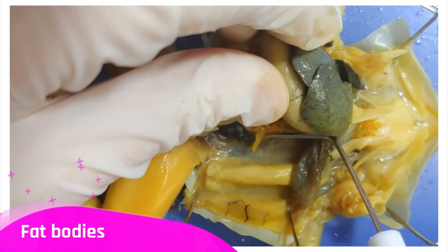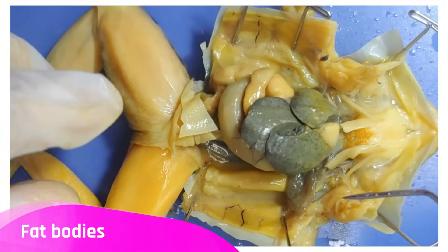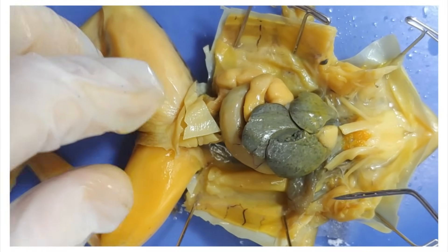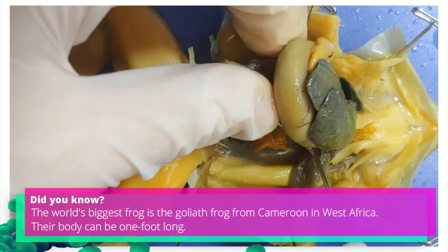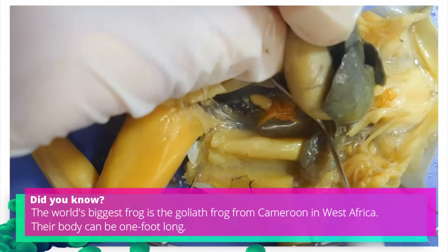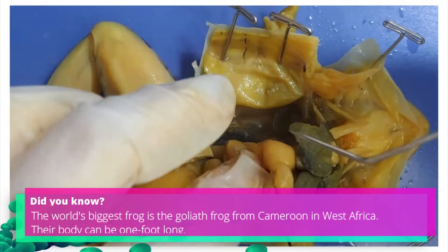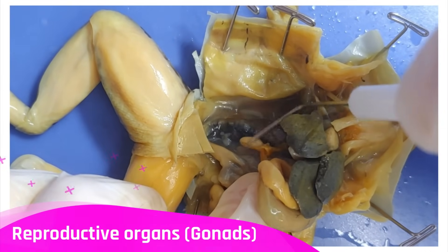You can see the fat bodies along the body cavity of the frog, which is where fat is stored. Here are the reproductive organs, also called gonads.